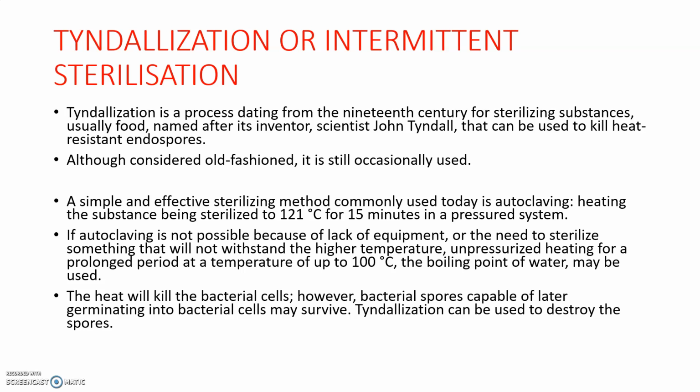So this method is used in tyndallization. The heat will kill the bacterial cells, while bacterial spores capable of later germination into bacterial cells may survive. So tyndallization can be used to destroy the spores.